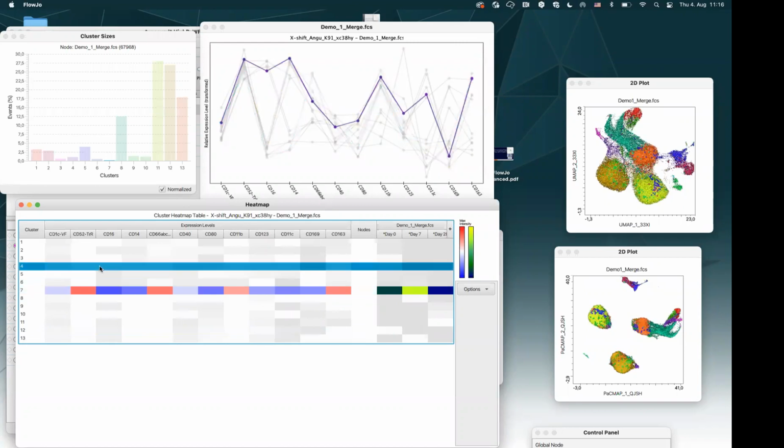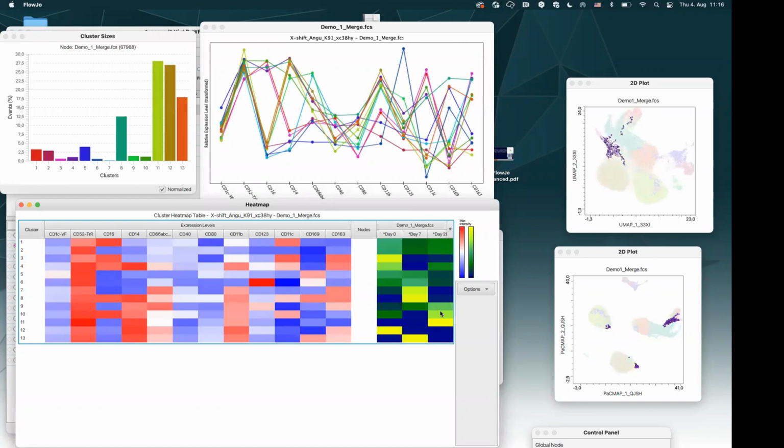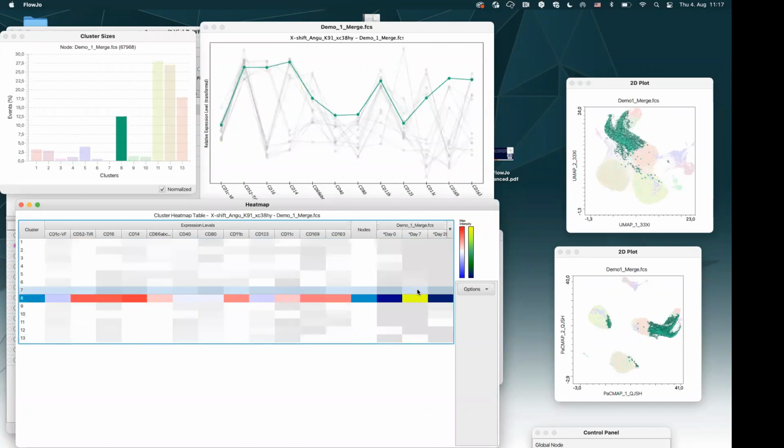If you're searching for unique populations after treatments, we can see those, for example, again proving that the inflammatory, intermediate monocytes appear at day 7, and that's why they're unique clusters at day 7, and they disappear after resolution at day 28.